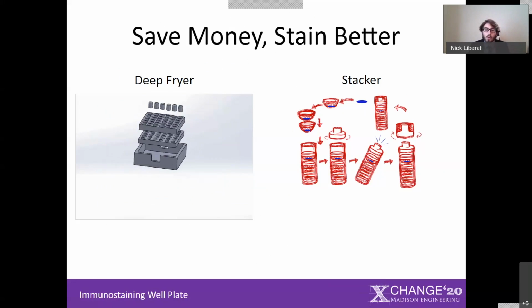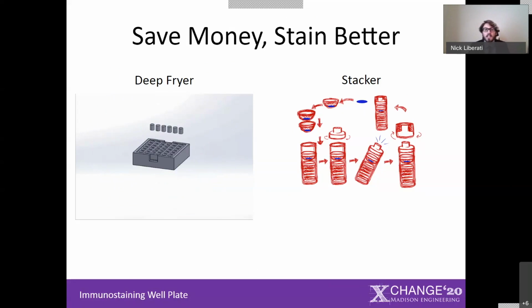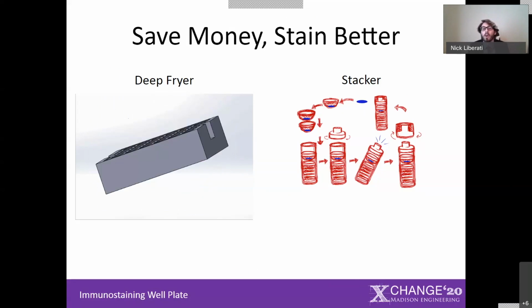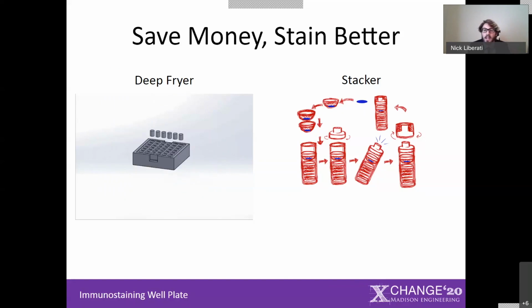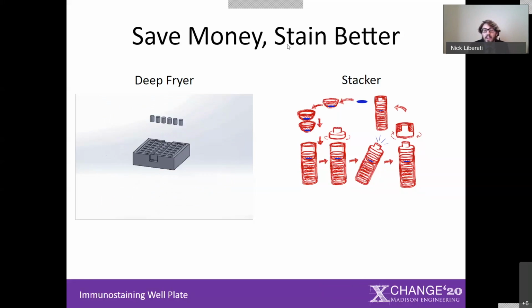The idea of serial ordering will allow the user to organize tissues in a specific manner so that after the staining process, they can be recreated. Reflotation will ensure that the tissues within each well are exposed to antibody solution on all surfaces, yielding the most accurate results. Additionally, these concepts both feature a modular design, meaning they can be connected together to minimize space, as well as allowing the user to vary the amount of tissue stained per trial.